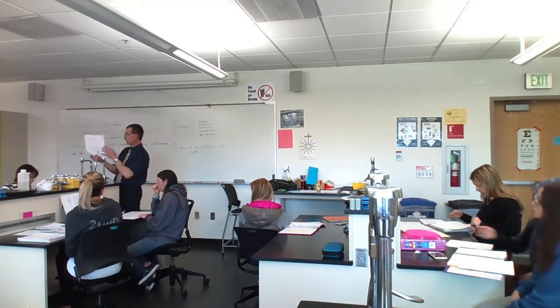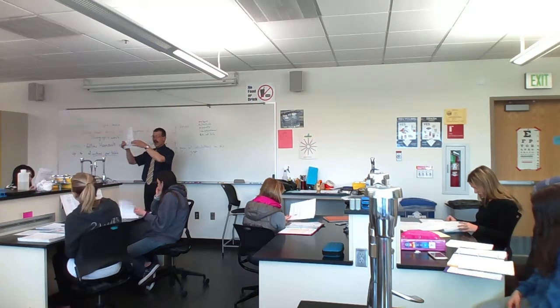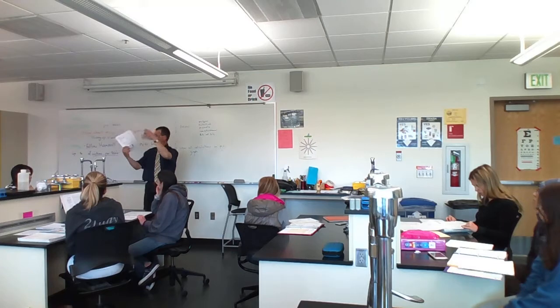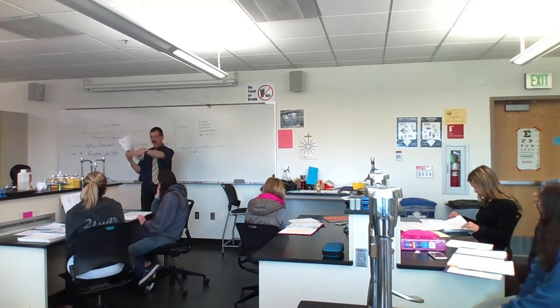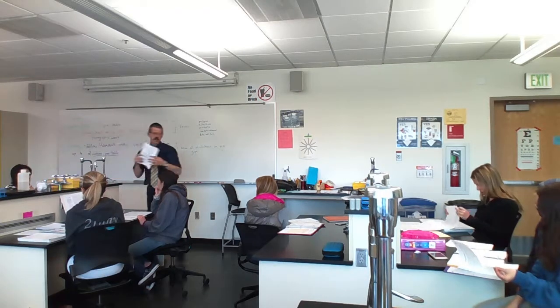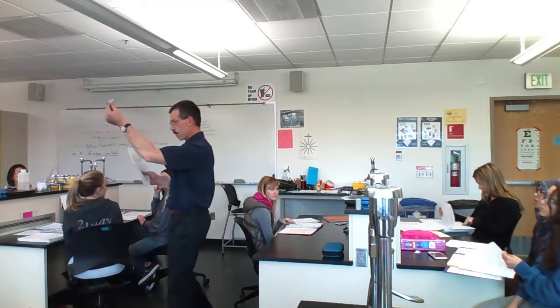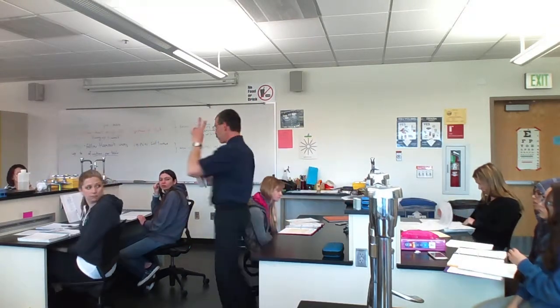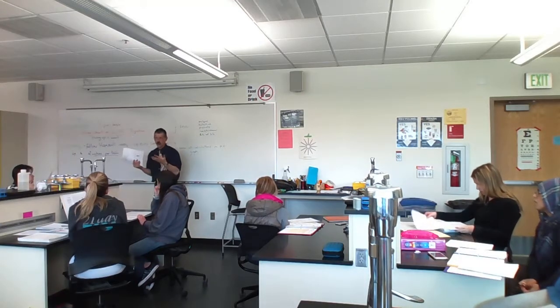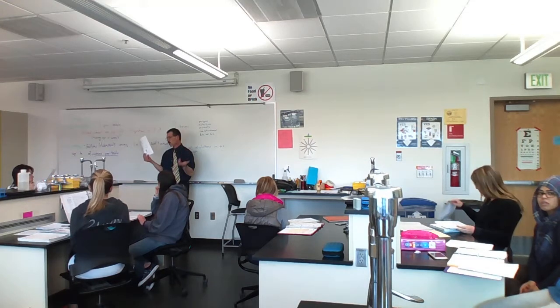And what you're going to be doing is doing exactly what this picture shows. You have bacterial filters. Okay? That's going to go on so your spit can't end up in the electronics and grow mold. And then you have the scientific mouthpiece, aka cardboard toilet paper tube. Right here. We have enough equipment that up to 2 of you at the table can be the victim. One of you can do it, or up to 2 of you. You don't have enough equipment for everybody to do it. So you want to pick your victims, whoever wants to do it.